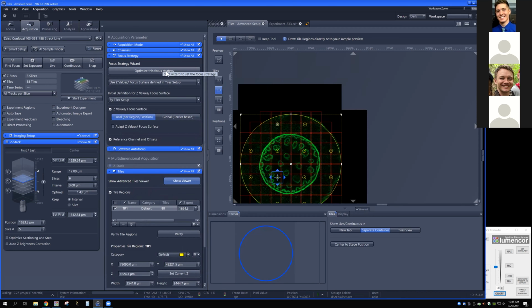We're going to talk about that in a bit, but what you're going to notice is that this gives you basically a default. As soon as I have tiles activated, it assumes that I'm probably going to want to use the Z positions that I ask for in tiles or the support points that I create in tiles. And so the default is always going to move you to using Z positions here. And probably that's what we want.